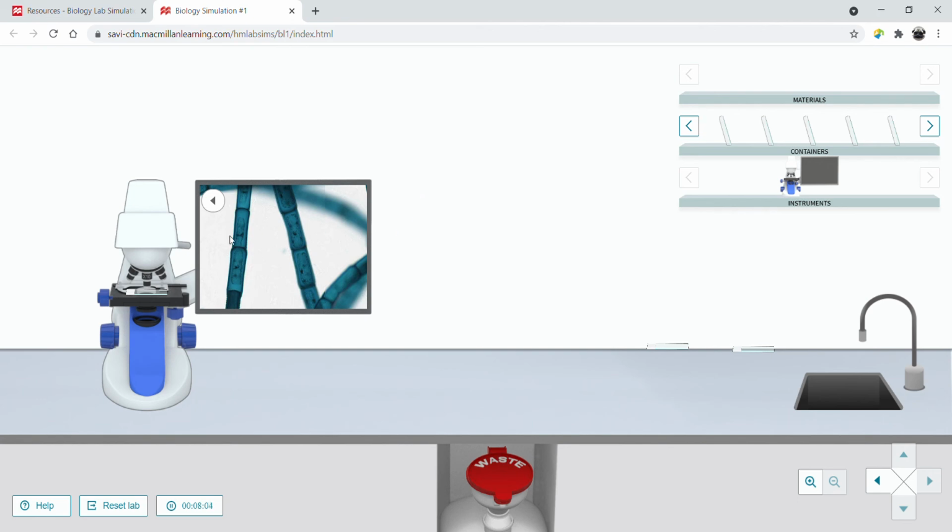So here, you have cell walls. Your nuclei are really pretty tough to see. You can see the cell membranes right here. Your chloroplasts are really kind of dark little circles. So you're to label A, B, and C on figure 2: a cell wall, nucleus, and a chloroplast. So we'll go ahead and have you do that.